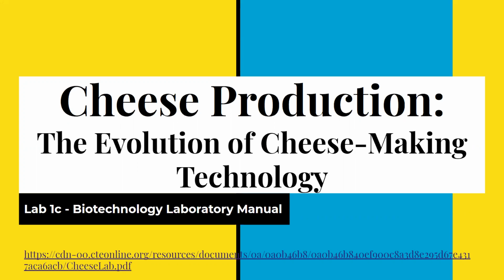Our first real lab that we're going to be putting in our actual lab notebook. Remember, with the lab notebook, we want to write a little slower, a little more careful. Not the end of the world if you make a mistake, but could be annoying. This is a formal document, so you want to think formality. When I ask you to write, you're not going to write super slow because we don't have that much time, but just a little slower, a little more careful.